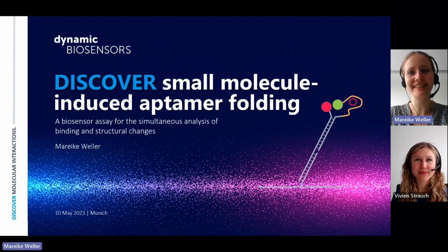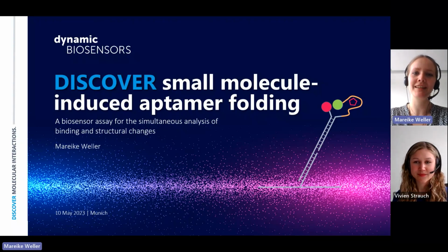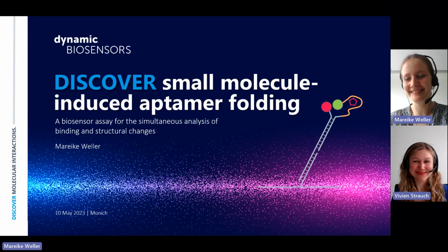Thank you. I'm very happy to be here, and I'm also very happy that you all joined, so that I can tell you more about this webinar's topic. It's about the discovery of small molecule binding to aptamers. I will show you an assay for how you can measure aptamer folding on a biosensor assay to simultaneously analyze the binding, but also the structural changes. So with this, I'd like to welcome you.